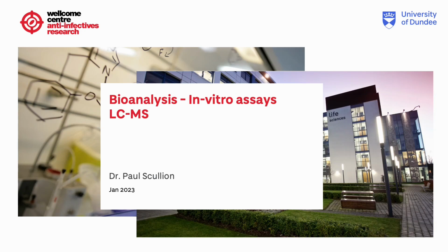There are a wide range of in vitro assays that use LC-MS for detection, including clearance, permeability, plasma protein binding, and enzyme induction and inhibition. In this talk, we'll look at what's involved in the analysis of such assays.